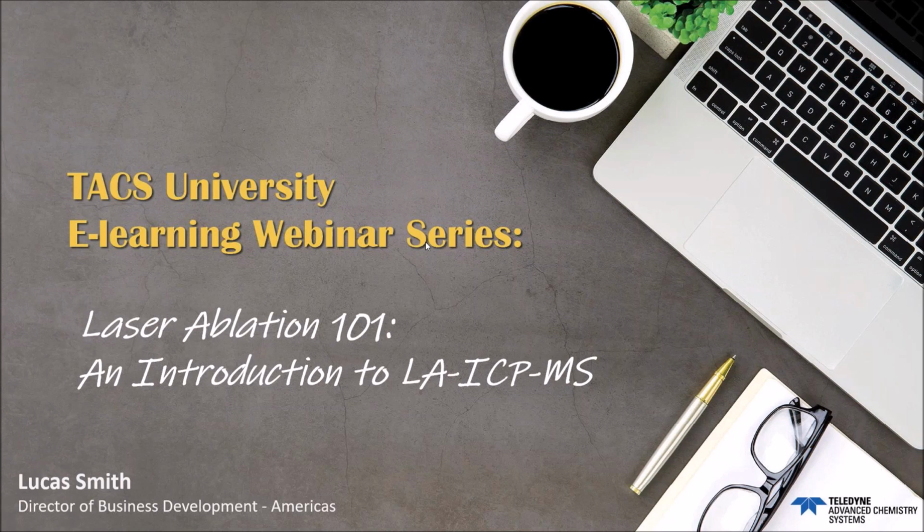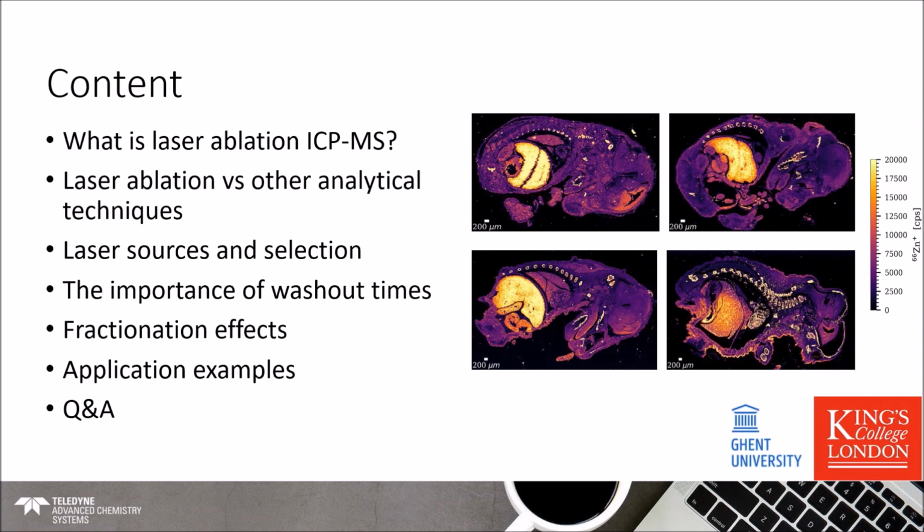As far as content goes, what are we going to cover today? Well, we're going to start by defining what laser ablation is. And as you can imagine, it probably wouldn't be much of an introduction to the technique if we didn't start there. We will talk about it relative to other analytical techniques and talk about some of the advantages that it provides, exactly why we should be looking into it. We'll also talk about the different laser sources and how to select between them. And we'll talk about some of the more important laser topics, such as washout times and fractionation, before finishing with some application examples and, of course, the Q&A session.